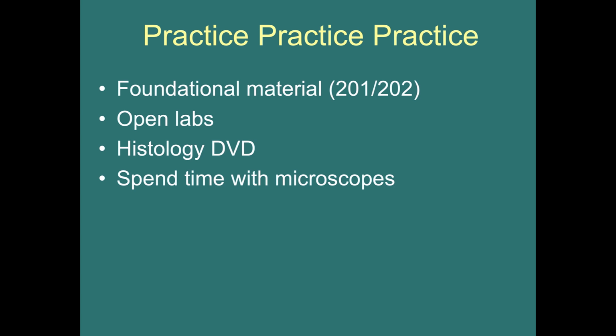When you get into labs this week, spend a lot of time looking through those microscopes. Too often now with smartphones, people come in, they look at a microscope, they take a picture of it, and they're like, I gotta go, I'm gonna get out of here. You've already scheduled your time in lab. Spend that time looking through the microscopes. Talk about it with your lab mates, and take turns throwing a slide onto a microscope and say, hey, what do you see in here? Can you describe it? Tell me what it is. And then have the person do it to you, and just go back and forth through that.